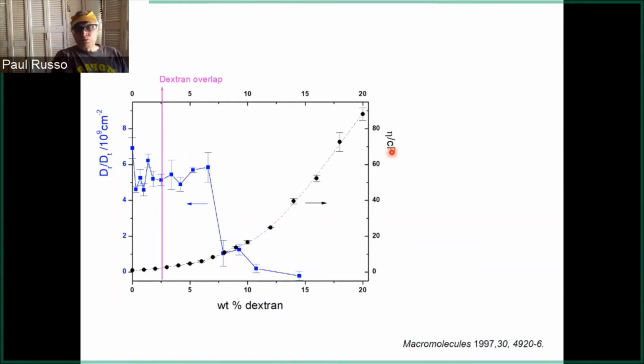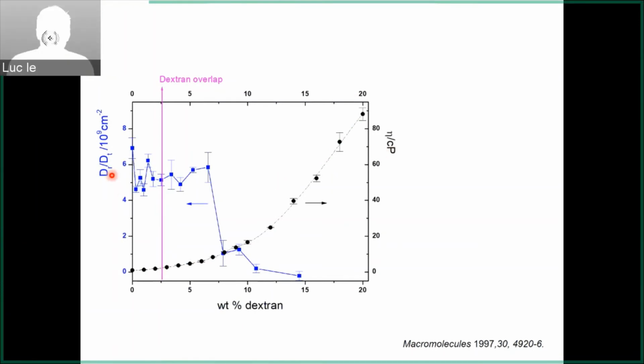They're getting older now. So anyway, you can take the ratio of rotation to translation, and sure enough, rotation seems like it's stopping faster. So we were very excited because this is evidence for entanglement effects, which is a big deal in those days. We were really excited. We write this paper, we send it to Macromolecules, instantly gets published, boom.